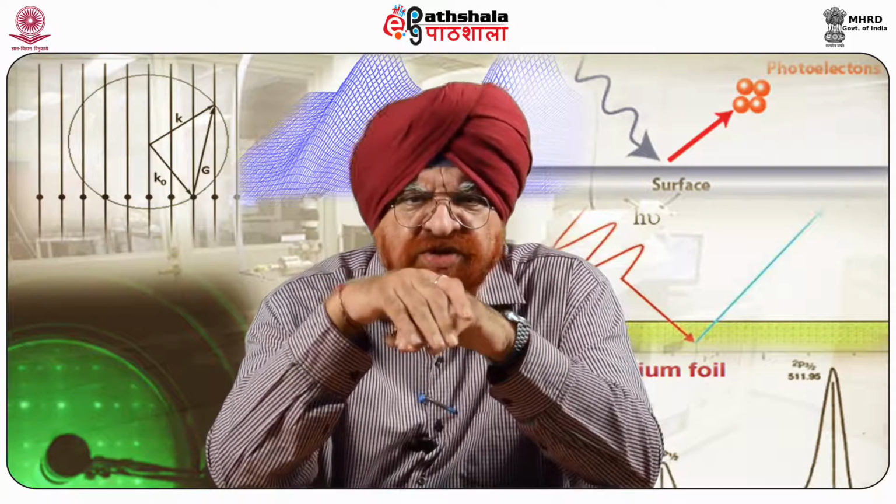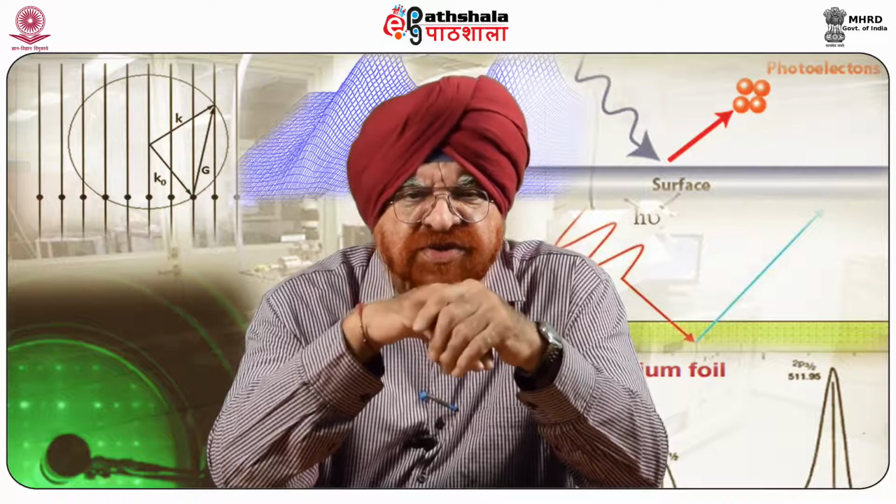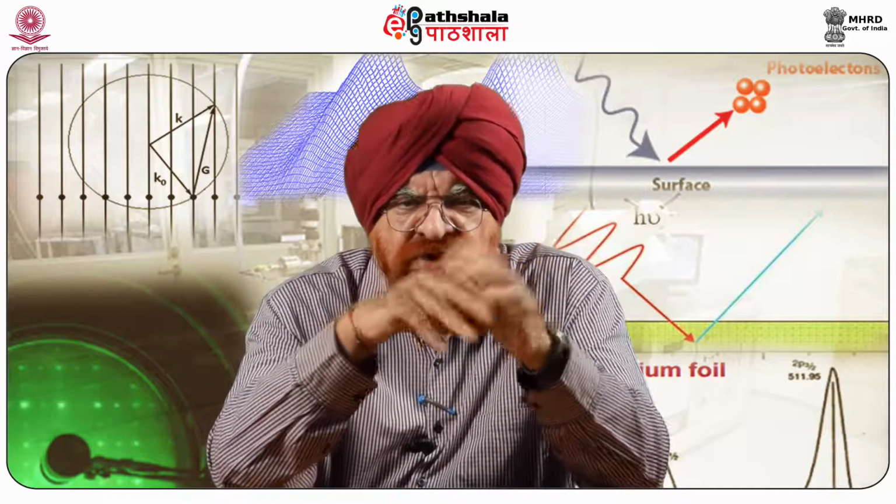The MFM measurements for the cobalt-free silicon and germanium films, both amorphous and annealed up to the crystallization temperature, suggest that magnetic activity is absent.